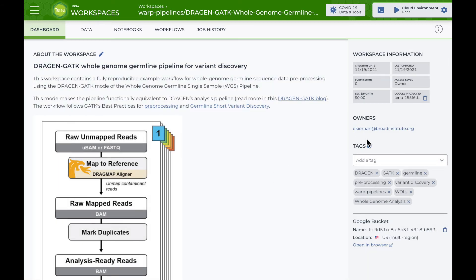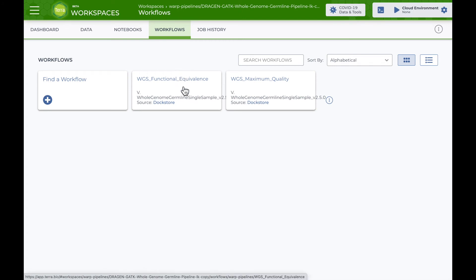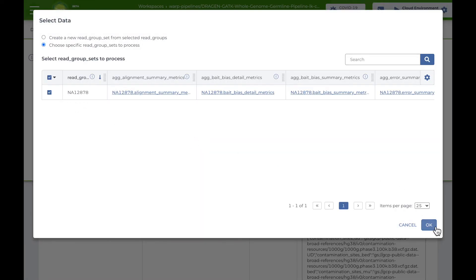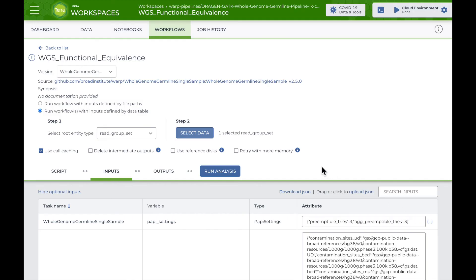Now I'm the owner of an editable workspace copy. To run the functional equivalence workflow, I'll first select it from the workflows page. In the setup page, I'll select read group set table as my root entity, and specifically choose the NA12878 dataset. Then I'll save. Since the workflow inputs and outputs are already configured, I can select run analysis and then launch.